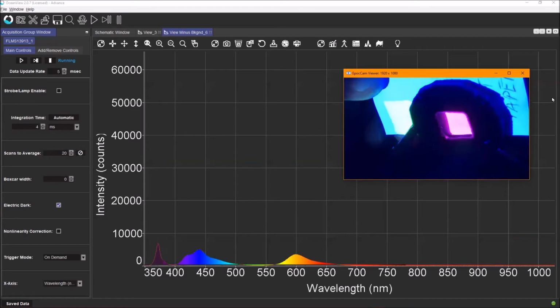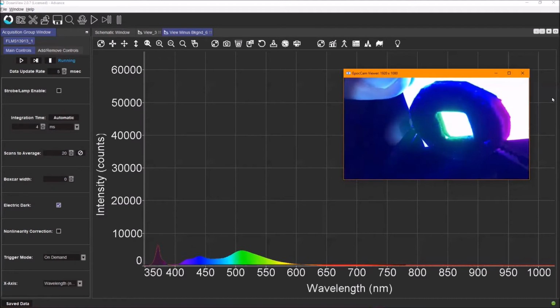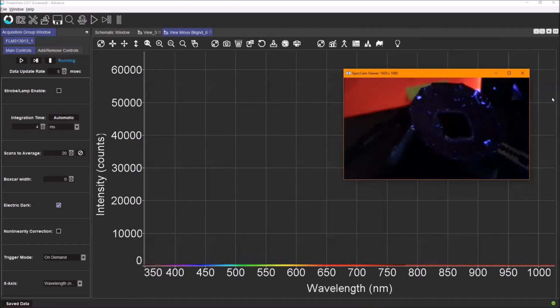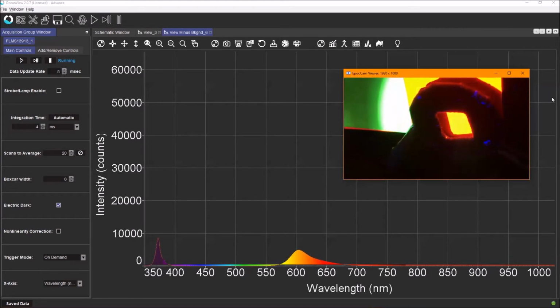This is white paper with pink marker. You see the new peak around 600. Makes it pink with the other colors. And this is white paper with yellow marker. New peak now around 520 nanometers. So this is all fluorescence. Also, the bright red piece of paper I showed you before does fluoresce at 600.